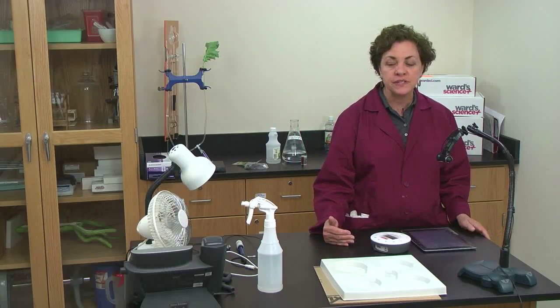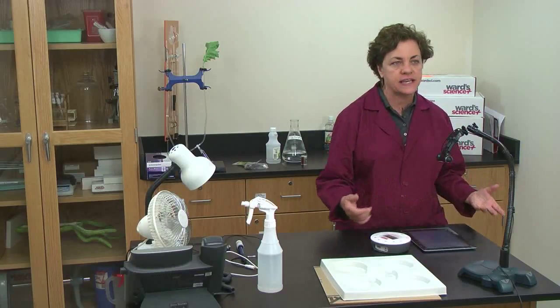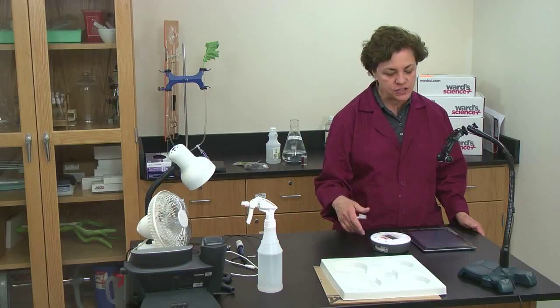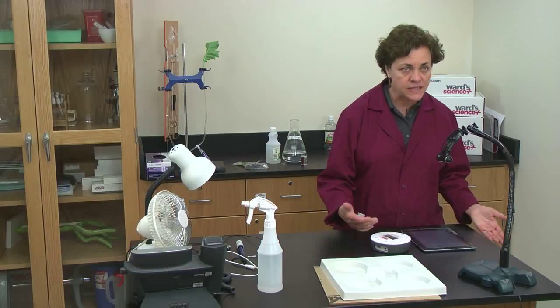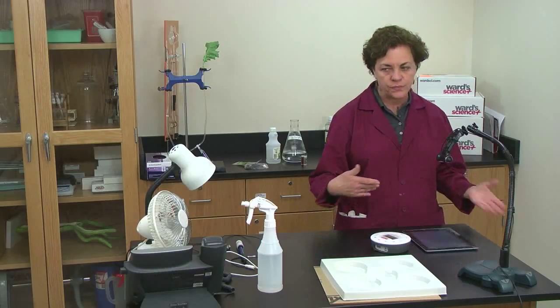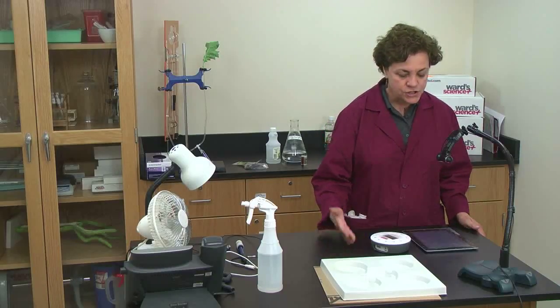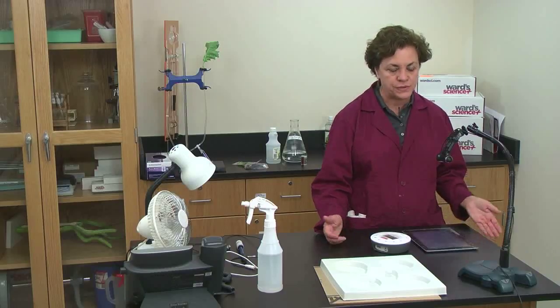For the computer, when you buy the Datahub, it will actually come with a disk that will allow you to download the software, and you can then control it from the computer. It's easier on the iPad. I think most people have iPads, either personal or at school, or they can lease one out from the IT section for the day. So we're working on that today. It's a little easier than the computer.